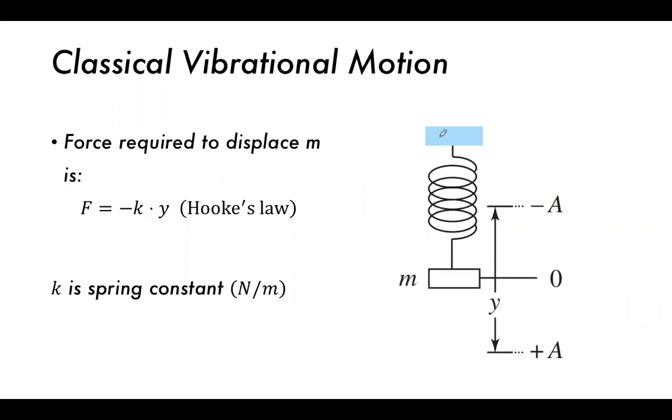If we have, for example, 2 atoms separated by a distance, say a carbon atom here and a hydrogen atom here. The carbon is our fixed position because it's much heavier than the hydrogen. So this hydrogen will oscillate backwards and forwards according to harmonic motion, if this were a harmonic oscillator, where F is going to be the force required to displace this hydrogen atom.